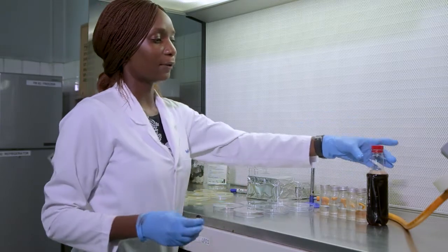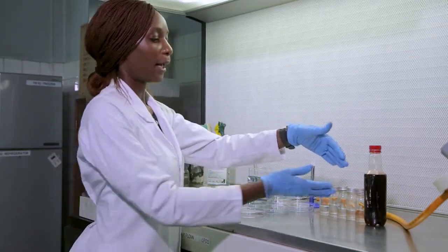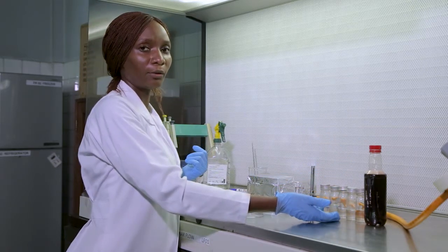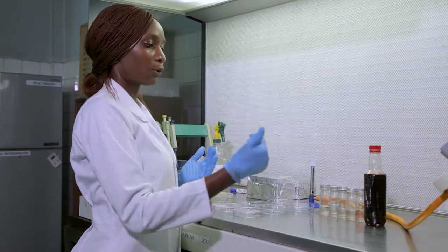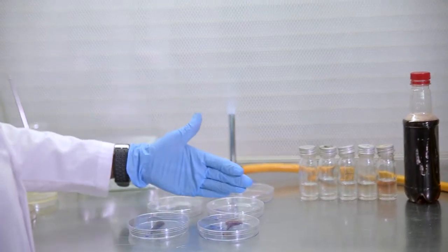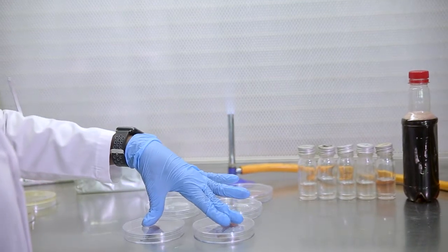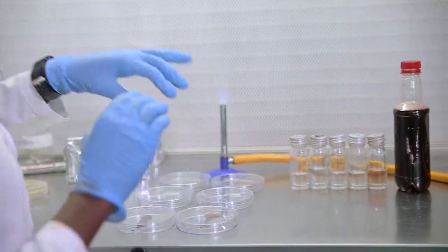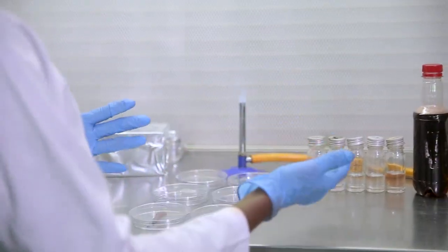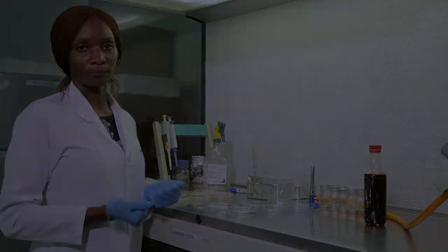Okay, what I mean is, if for instance the sample has very few microorganisms and I carry out the serial dilutions, I may actually be diluting nothing after the first dilution, after the second dilution. So it is important that we also plate the sample in case we don't have any growth on these other dilutions, the 10 to the power negative 3, the 10 to the power negative 5. I should be able to get something in the sample itself. If I still don't get counts in the sample itself, then I can have confidence that the sample had a very low concentration of microorganisms or was actually sterile.